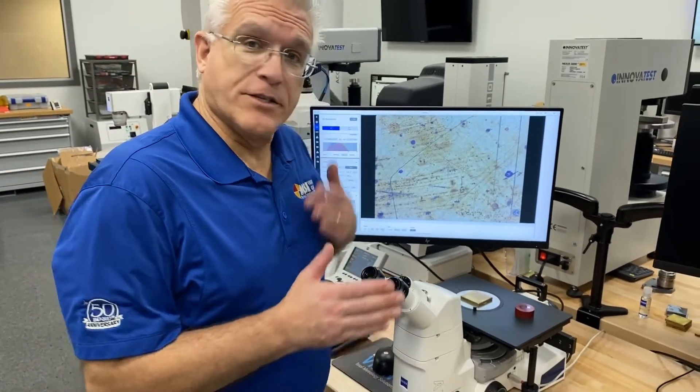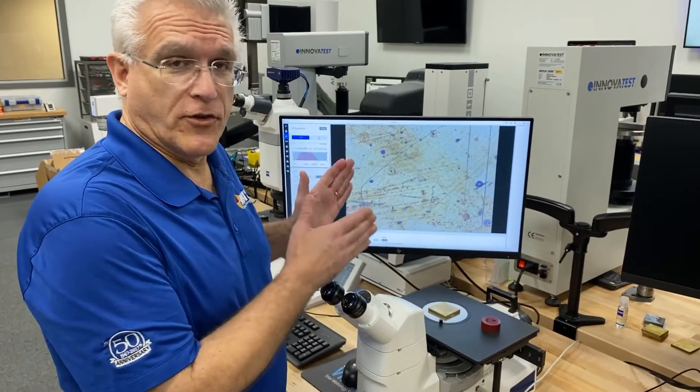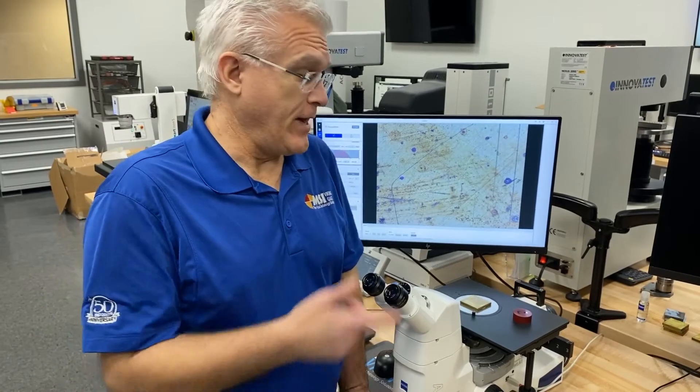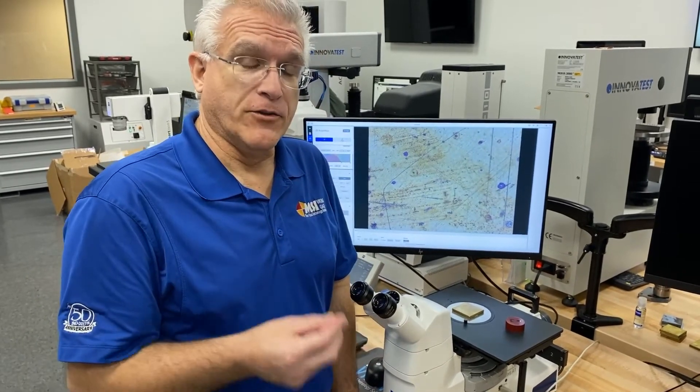Encoding allows the microscope to communicate with the software, and the benefit for you is that it's more accurate, it's more repeatable, and makes your people more efficient. It's a best-in-class feature.